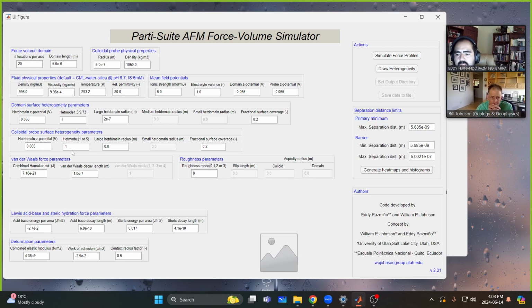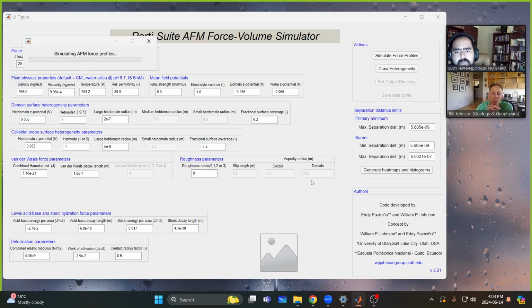Yeah, we still have headroom and we can have here the radius. And I would say something smaller makes sense here, like, I don't know, like 50 nanometer. 50 nanometer, that's a reasonable number, right? Okay, now it's ready to run. I mean, we're guesstimating these sizes. That's all we can do at this point.